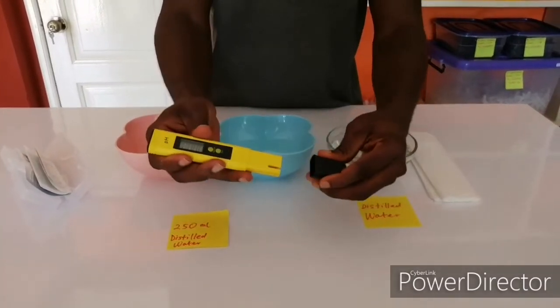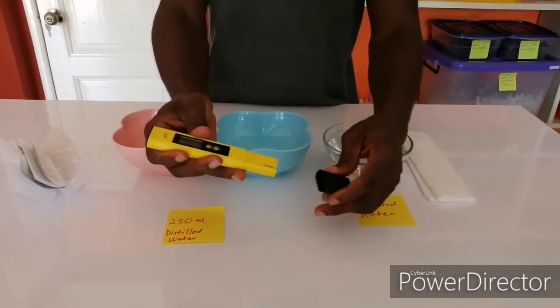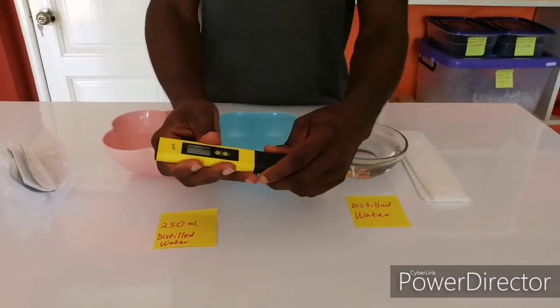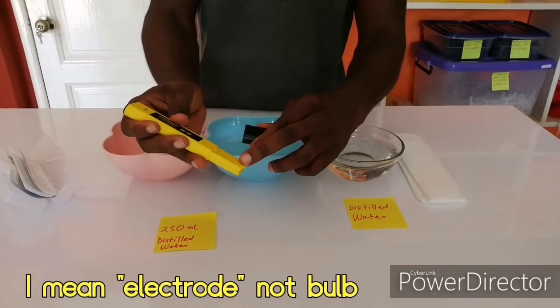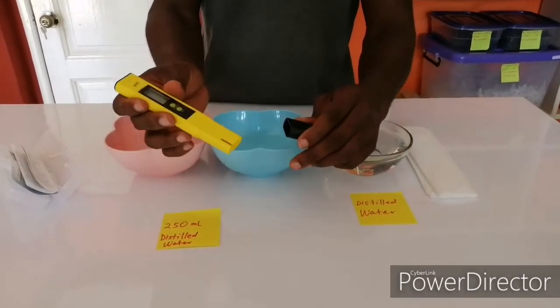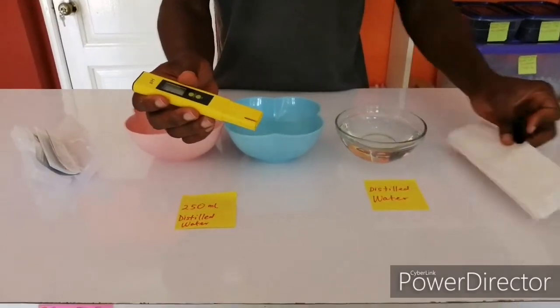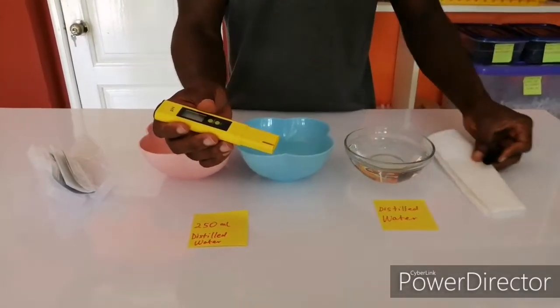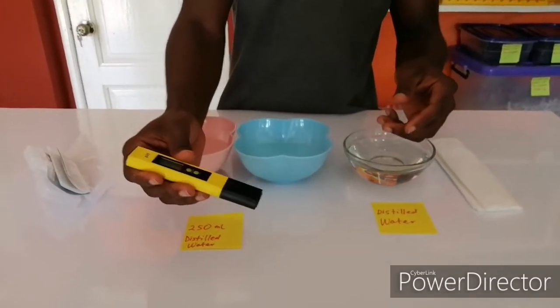This is the protective cover of the pH meter. This cover should always be put back on, so that your bulb will not dry up. If it dries up, it ruins your pH meter. So after everything, you need to clean it with a nice cloth or tissue, and then cover it and keep it wherever you want.